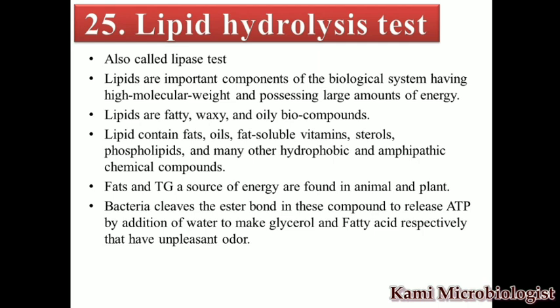Now today in this video we are going to see what the lipid hydrolysis test is. The lipid hydrolysis test is also called the lipase test. What is actually a lipid? Lipids are among the most important biological components of all living organisms, and they have high molecular weight, so they can possess a large amount of energy.